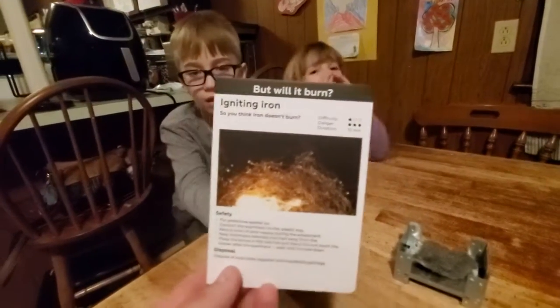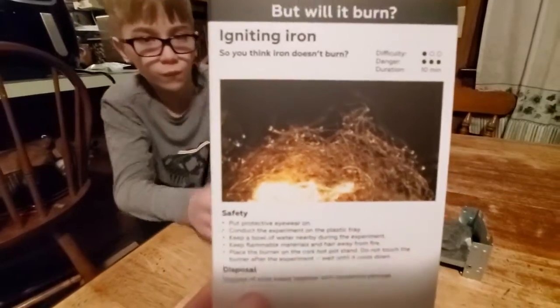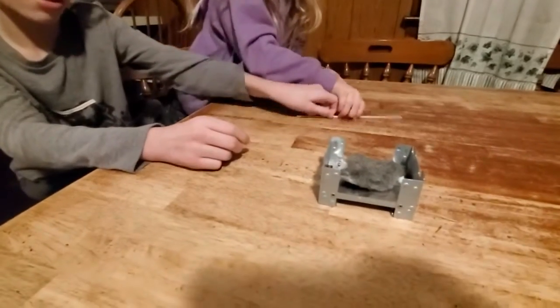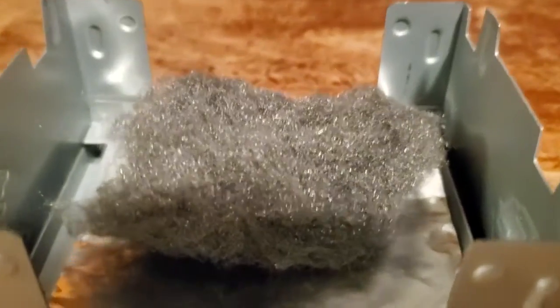Today's metal science experiment is igniting iron. So you think iron doesn't burn? So here's our iron. It's called Fe.